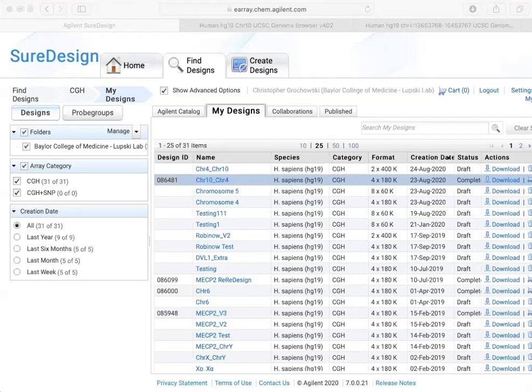Unfortunately, we have just 4 patients. If you have 4 patients, you could do a 2 by and strip it, or do a 4 by and not strip it.